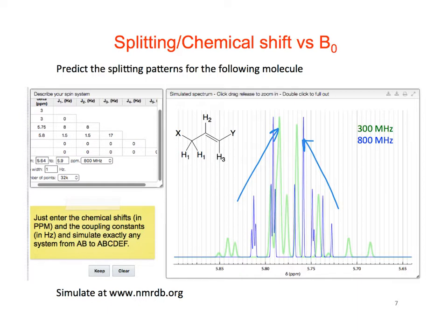Okay? On this side, it's also 2 triplets, right? A doublet of triplets. We could measure that from the left side here to the left side of this one down here, because here's one triplet, and here's the other triplet. And they're almost overlapping in the middle. So even though it hits the baseline, it's still a triplet. Right? So it's kind of like, we can go back to this other one. Okay?